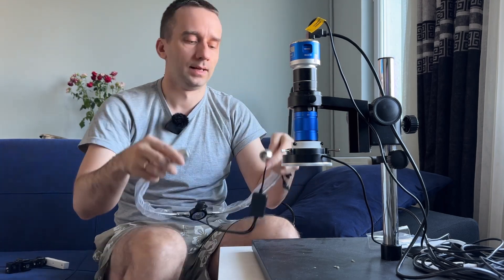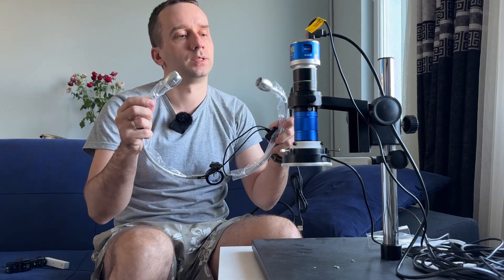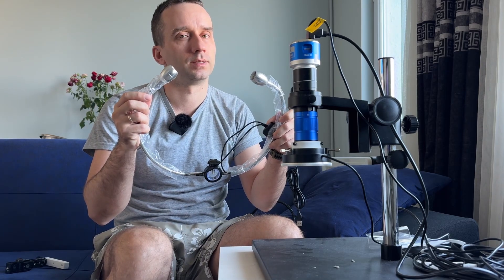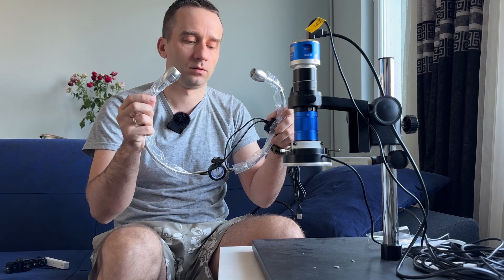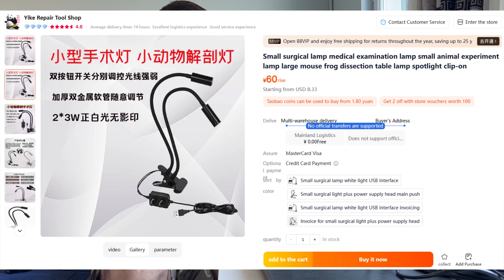So I bought two cheap lights. This one is I think 20 dollars and this one is even cheaper — this is 10 dollars.